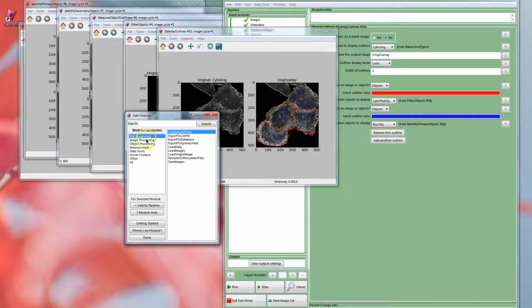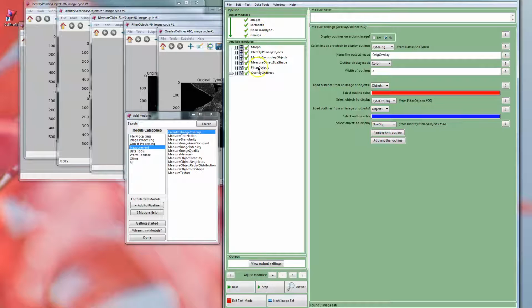And we've created these from a bunch of different individual modules, of which there are many, so it's very flexible. You bring these modules in together here and you just order them as you need them, and it rolls down from one to the next, and you can have a succession of different things that you can then work with and output and go from there.